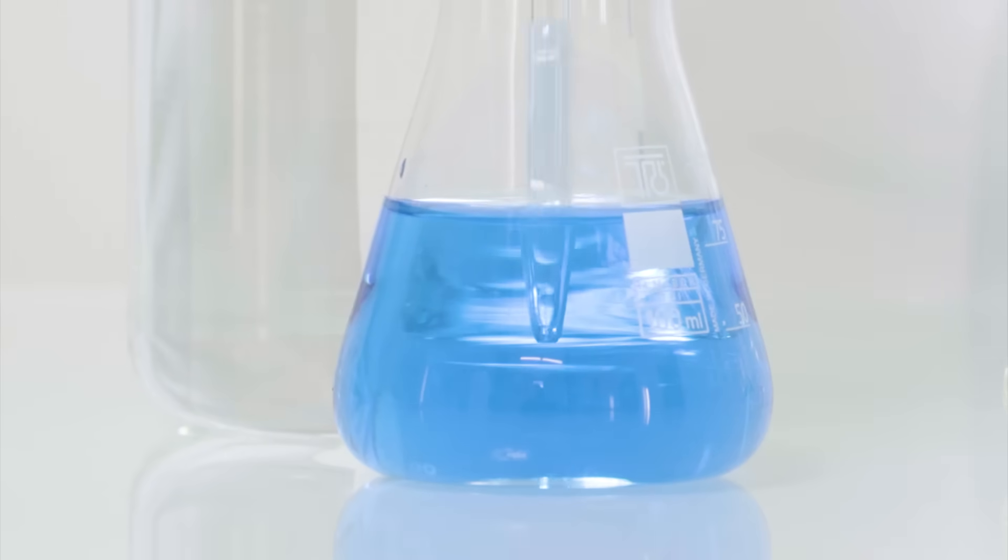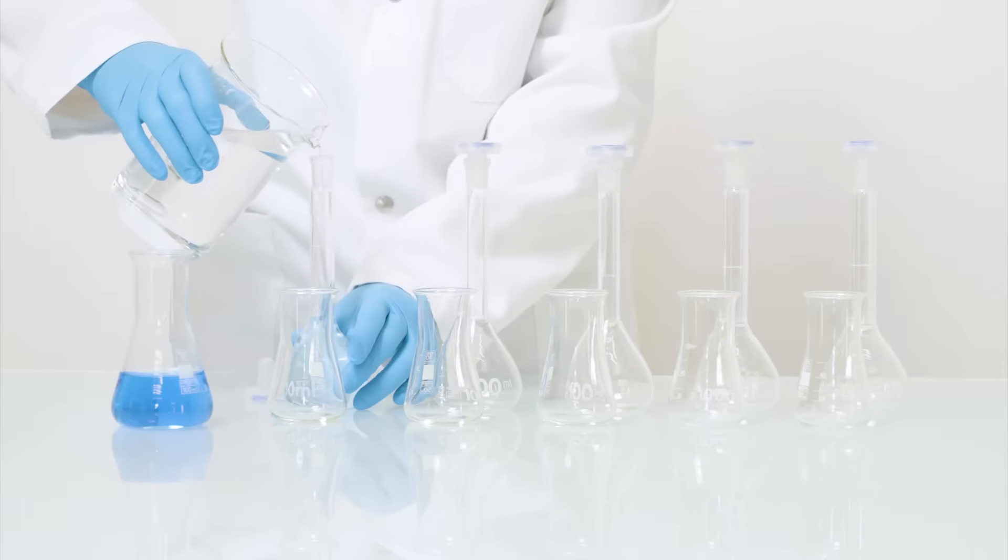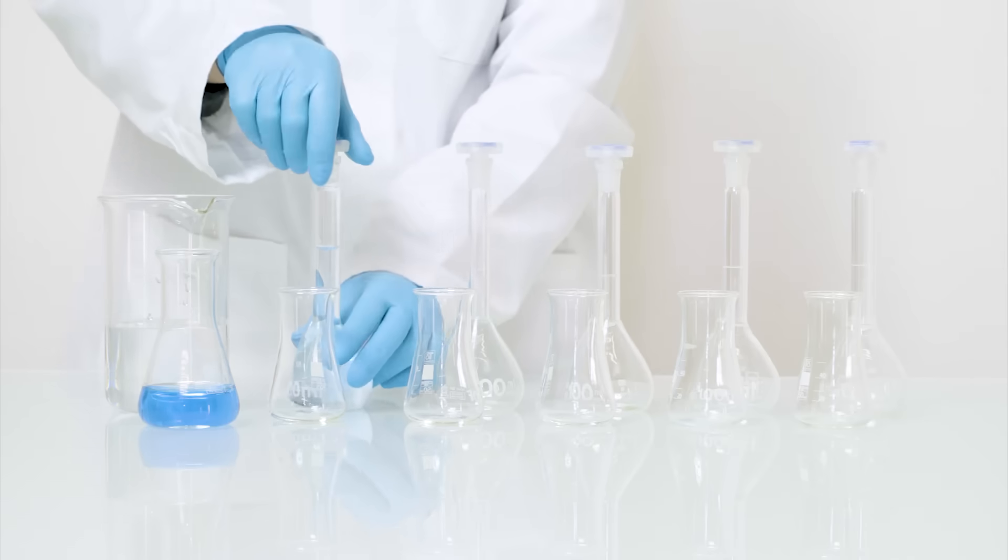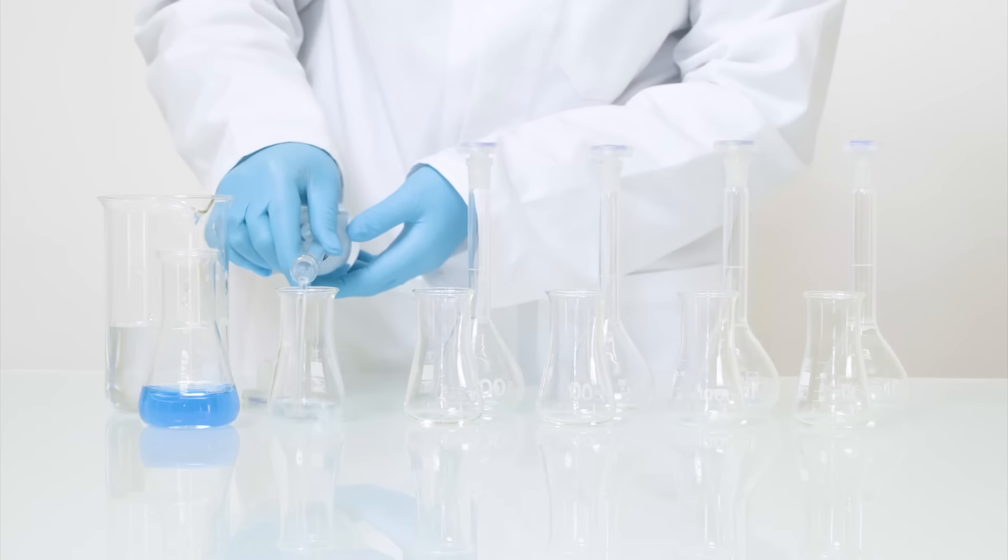Does this procedure look familiar to you? Do you spend a significant amount of time every day preparing standard solutions or serial dilutions? These routine tasks can take up a lot of your precious resources and you can never be a hundred percent sure the results are accurate.